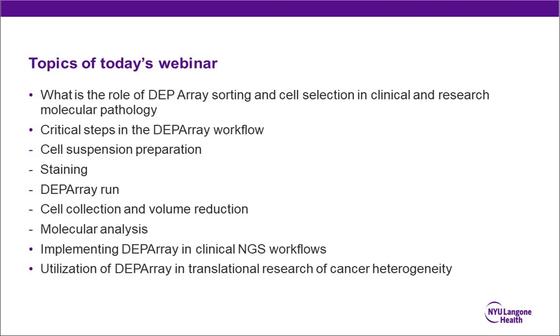So what we'll be talking about is what is actually the role of DEPArray sorting and cell selection in clinical and research molecular pathology. I will review with you critical steps in the DEPArray workflow, focusing particularly on cell suspension preparation, cell staining, how to perform a successful DEPArray run, and then talk about cell collection and volume reduction, molecular analysis, and how to implement DEPArray in either a clinical NGS workflow or how to utilize DEPArray in translational research and cancer heterogeneity.